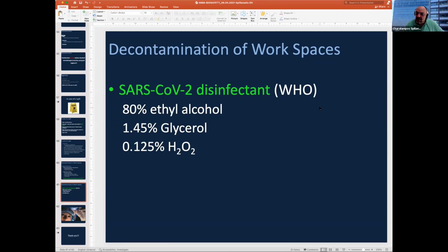What are we doing with the rest of the material used for the COVID test, the sticks, in case they are positive? I would say the same thing. If they go to the same blue bags, they will be autoclaved, as long as no one is touching inside the bags and the containers. That's what I would do, because I think they're being collected and autoclaved on almost a daily basis. Then I would dispose of them there and not in the normal garbage.